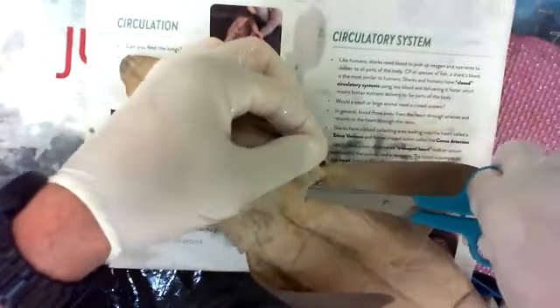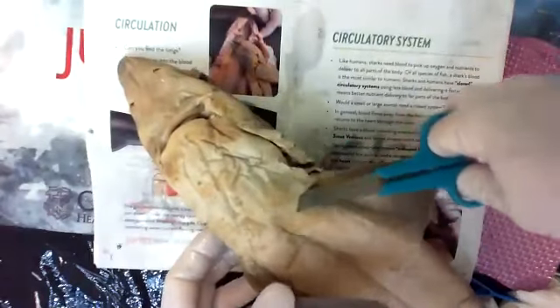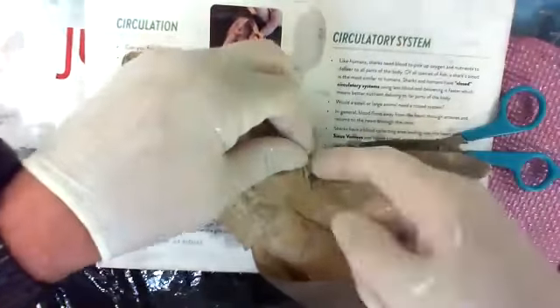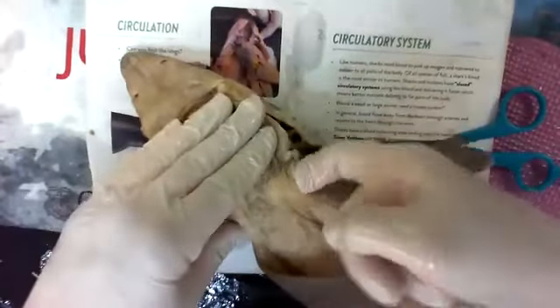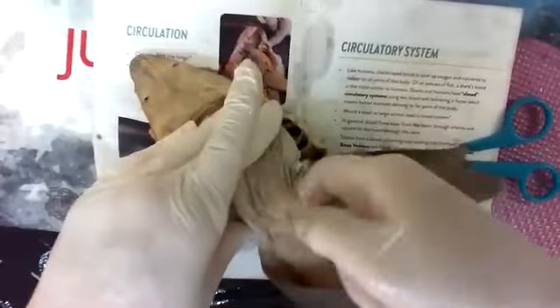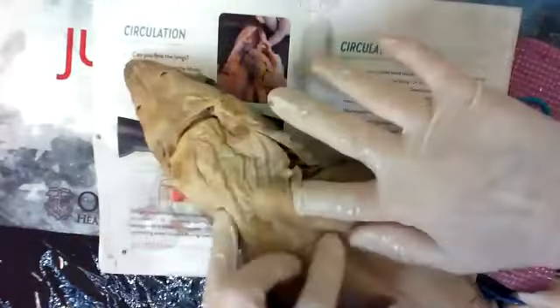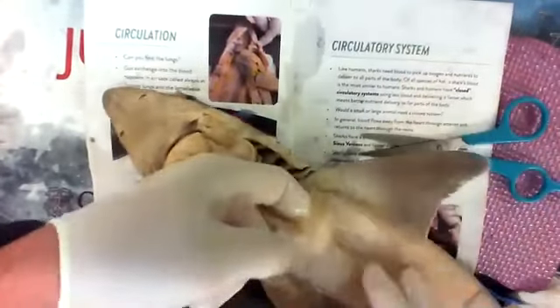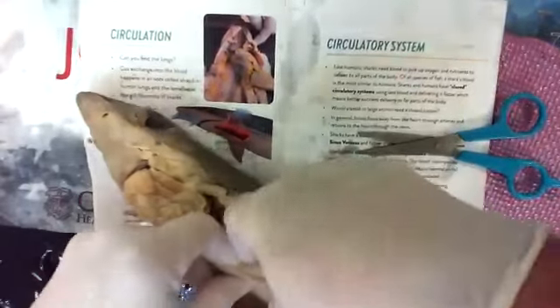It's called blunt dissection. So I can open it and do this, and you can see where my scissors are going just under the skin, separating, separating. Your fingers will do the same. Once you have a good pocket in there, you can slide your fingers under. This is also blunt dissection, and just wiggle them. And this is actually how I prefer separating organs. Just once I get in there, use my finger. I'm separating all over the place. My finger going down. You can kind of see the muscle patterns underneath here. I'm just separating.